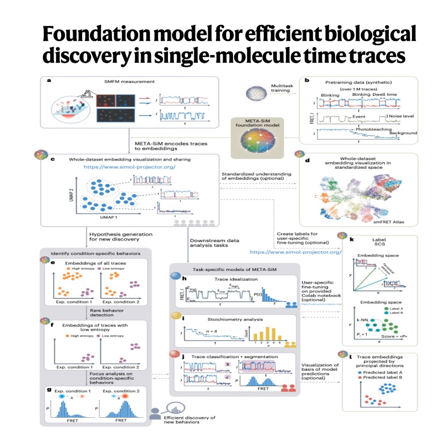The implications are pretty huge then. META-SiM seems to remove a major analysis bottleneck, improve objectivity, and maybe even democratize SMFM analysis. That's certainly the potential. By making sophisticated interpretation more accessible, even to researchers who aren't deep experts in computational biophysics, it could really broaden the use of these powerful single-molecule techniques. And the projector lets you see all this, the clusters, the outliers, the LSE scores, without needing complex manual processing first. It shifts the focus from wrestling with the analysis tools to actually thinking about the biology, generating hypotheses. That's the hope. Okay, that brings us to our final thought, a look towards the future.